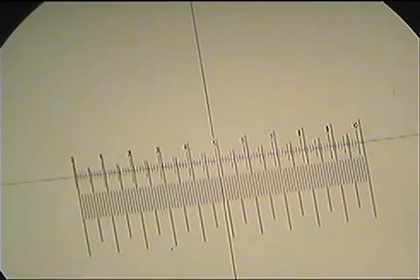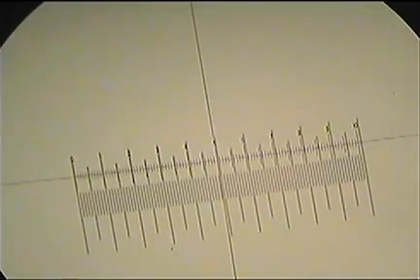So looking at where it lines up, I'm looking for two lines that line up. I've lined up at the 0, and a little bit of a hint there: if you're trying to rotate it, it's often easier to rotate the eyepiece rather than try to actually rotate the slide, since everything's a little bit back to front when you're moving things. Cool. So now I've lined up the 0 and the 0 on the left hand side from both our scales. So that point's lined up.